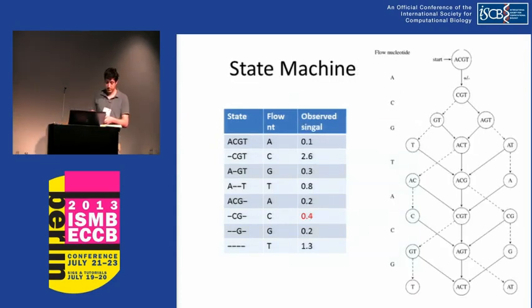So this, which so far has been an intuition, can be captured in the form of this state machine with a state graph. The nodes are states, and the edges give transitions between states. The solid edges are incorporations, and the dashed edges are non-incorporations, so you're losing candidates as you go along the dashed edges. The point is that any legitimate sequence is translated to a path along this graph. So this is when you apply rounding, and eventually you get stuck at an empty state, because you're at a G and there's no incorporation, so you don't have anywhere to go.